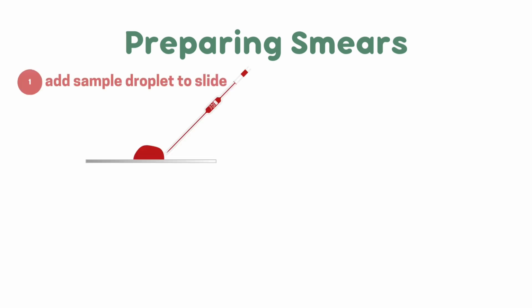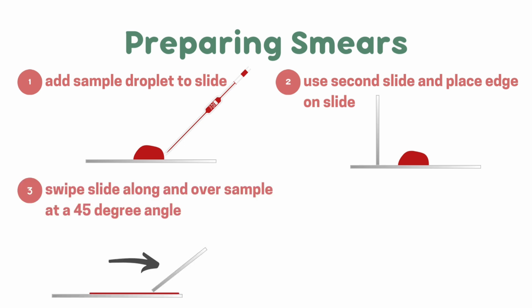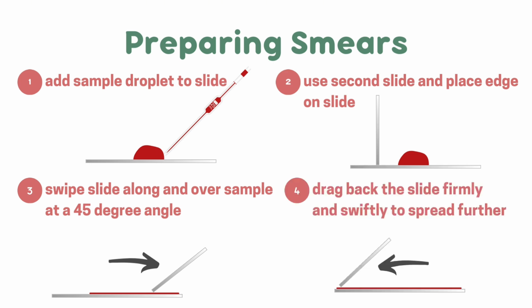Now we're going to go into carrying out smears. First, you add the sample droplet to the slide using a dropping pipette. You then use another slide and place the edge of that slide on the original slide with the sample on it. You then swipe this slide along and over the sample at a 45-degree angle. This will spread the sample along the slide. You then drag back the slide firmly and swiftly to spread it further and create an even coat.